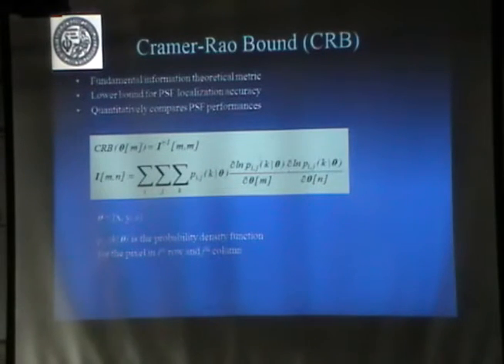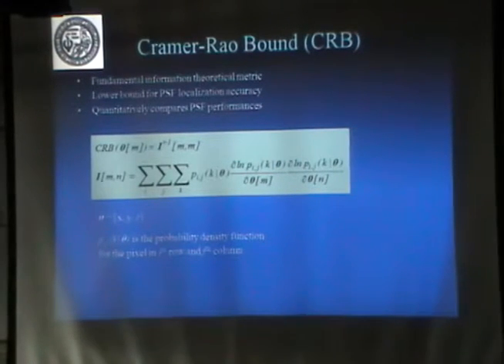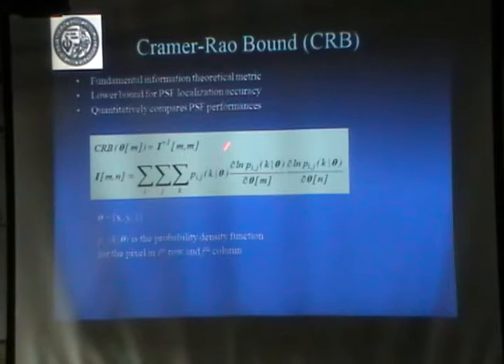The idea is, you want to have a measure of the derivative of the thing you are actually measuring, which is the height of the column, relative to the parameter that you want to find, which is the temperature. So these are these derivatives here, and you want to do that. The fact that you use the log is not so important.